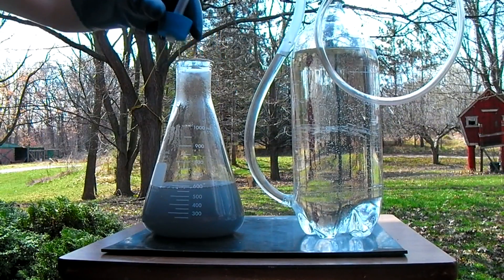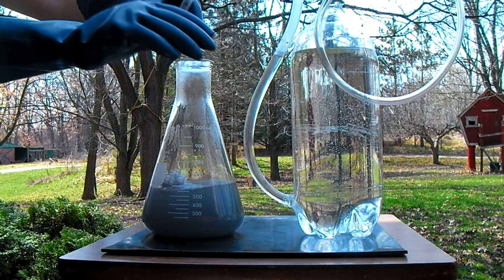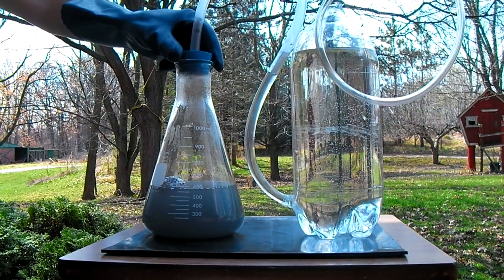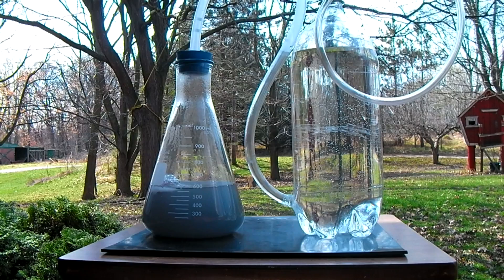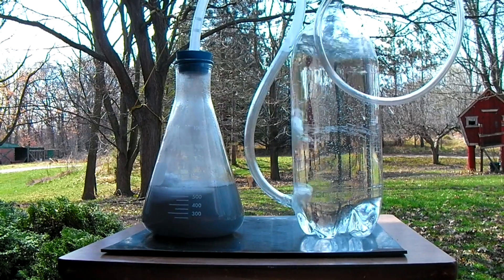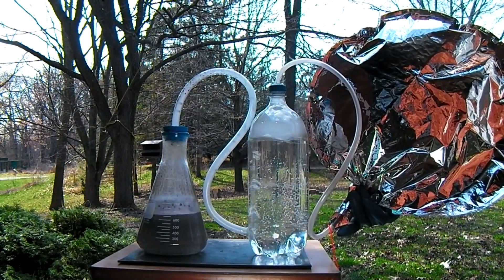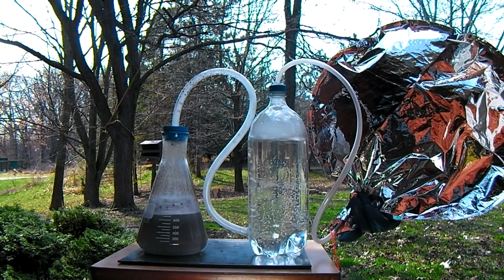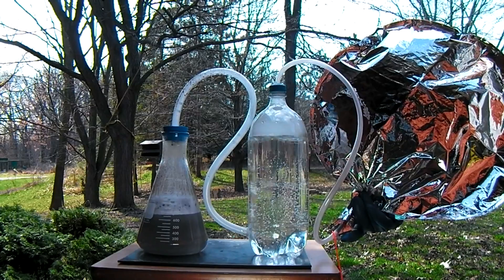Once the reaction slows to a stop, the stopper on the flask can be removed and another section of aluminum foil dropped in. This process can be repeated until a reaction no longer occurs. In the 300 milliliters of acid that have been added to the flask, there is enough hydrogen to fill about a 30 gallon trash bag.